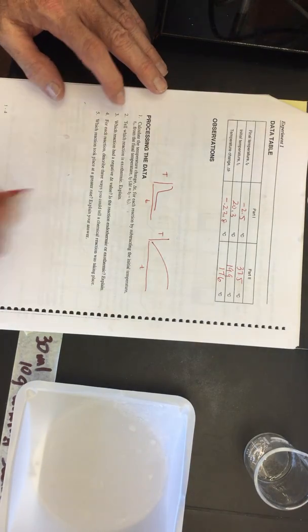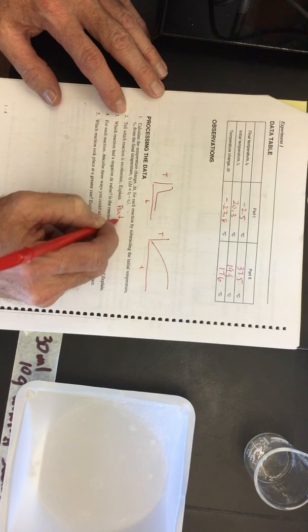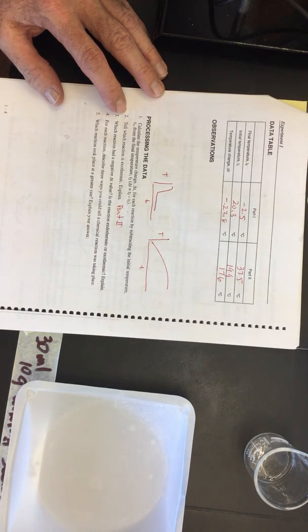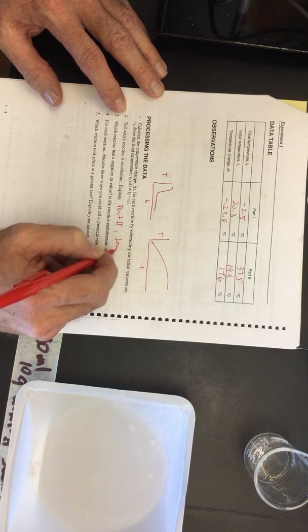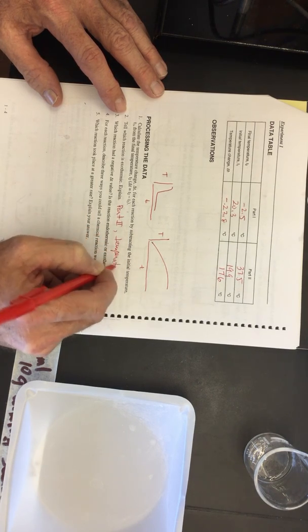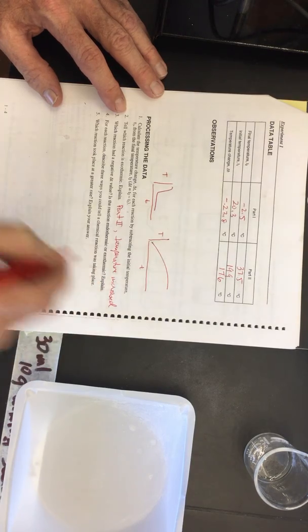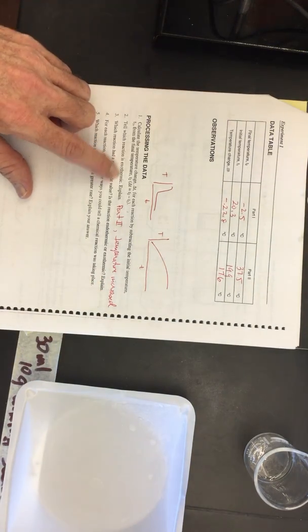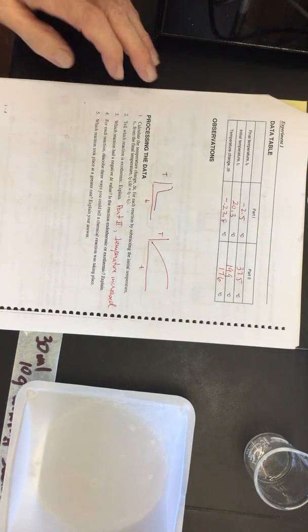So I'd like you to write that. Which part is exothermic? It's part 2. What's the evidence that you know that is exothermic? The temperature increased. Remember, exothermic is heat going out. Heat was released and the temperature increased during the duration of this.